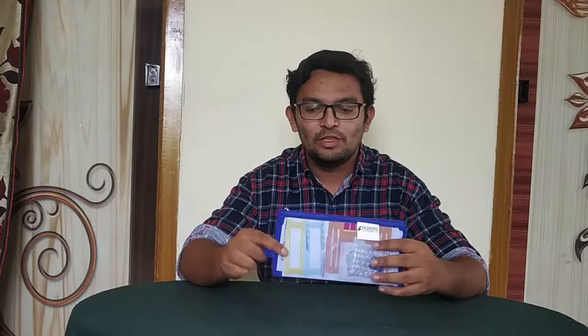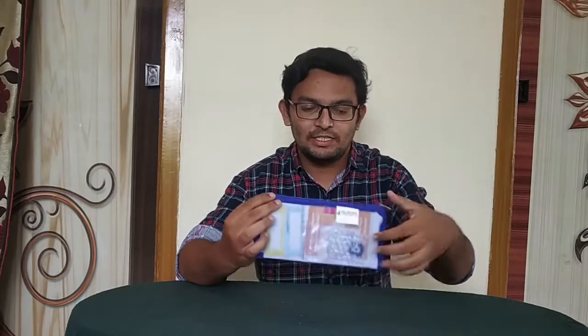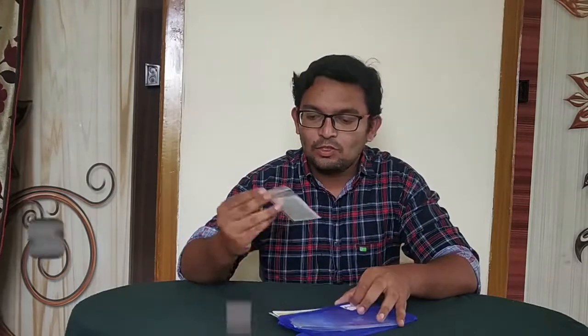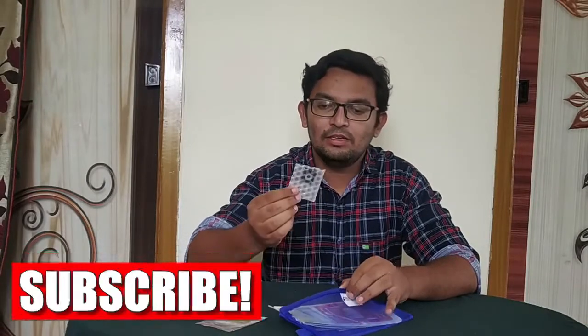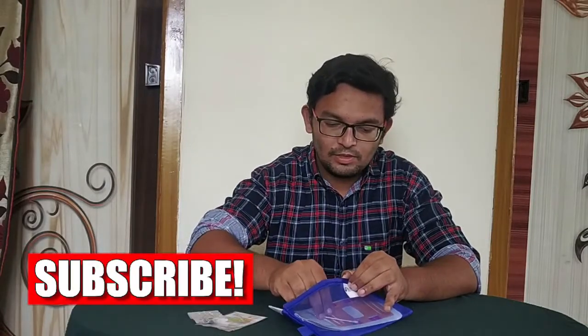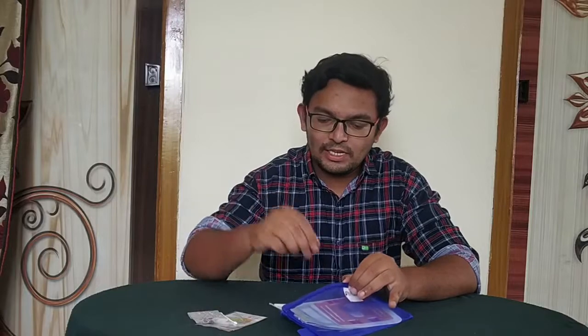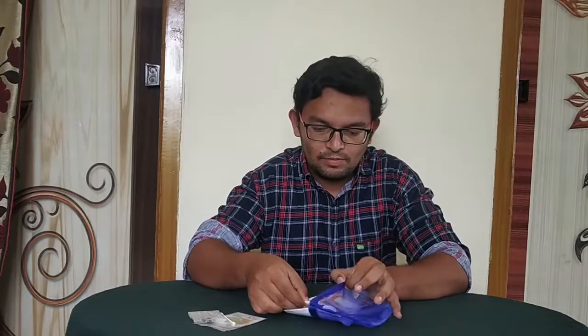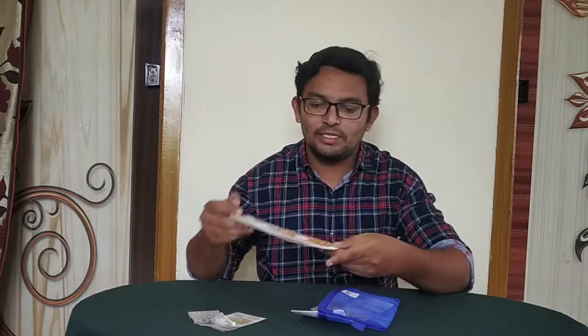This is a kit of foldscope. Let us see what is present in this. We have some stickers, a lens kit, a small lens cleaner, main microscope parts, a small card, and an instruction manual.